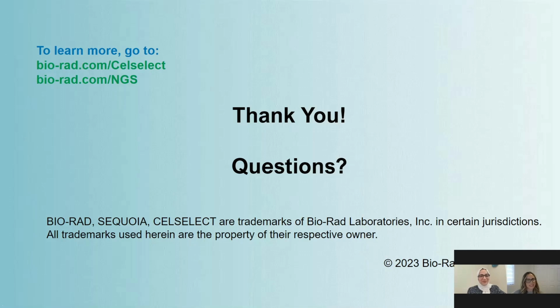Number two, once a blood sample is collected, how soon does it need to be used with Celselect? Good question, and very tricky as well. Normally two blood sample tubes are used with Genesis. One is an EDTA tube if you are interested in getting viable CTCs, and the other is a Streck tube if you're interested in doing enumeration. For the EDTA tube, as I believe everyone knows, the cells are not fixed.